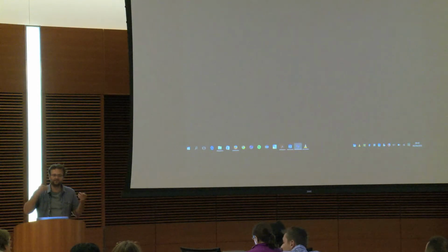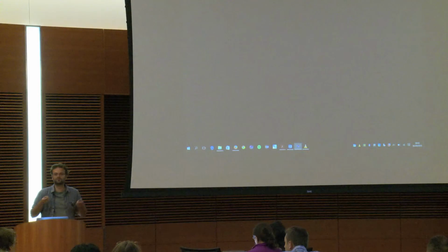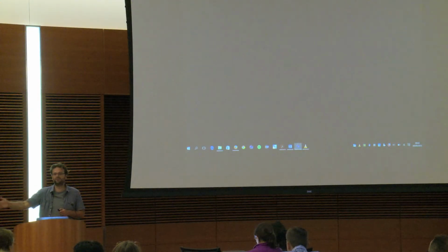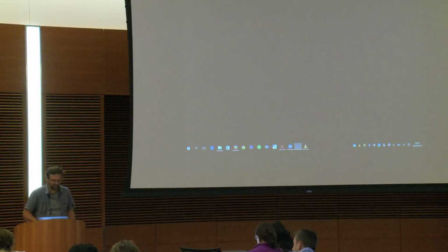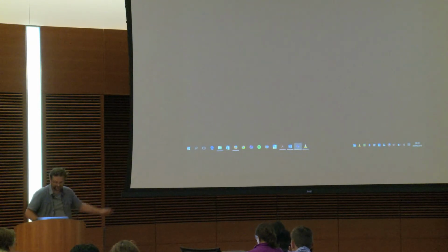Because it is the same question as for the undo. We didn't find a way to record efficiently everything. And it brings frustration because if the plugin is not created to be compatible with the macro, it doesn't work. But we will work on this if people keep asking. And we have a poster after if you want to ask questions. And here is my teasing for the poster.